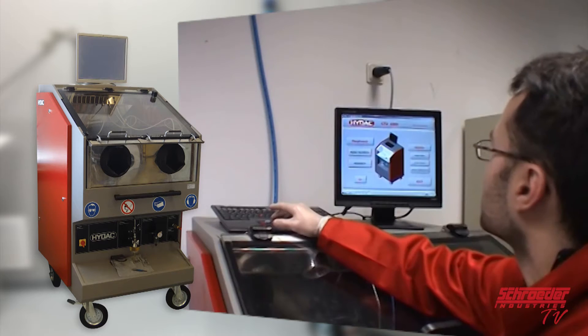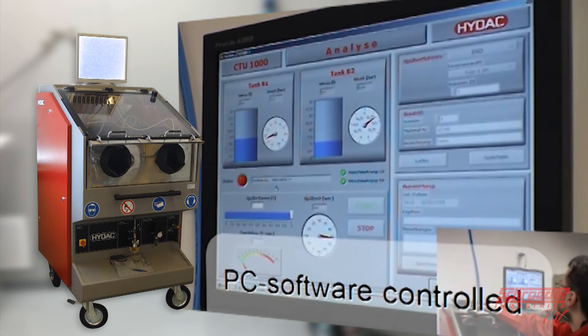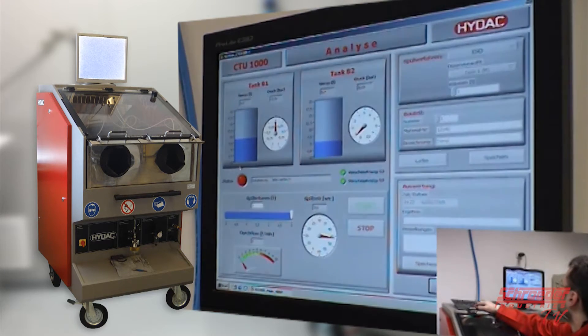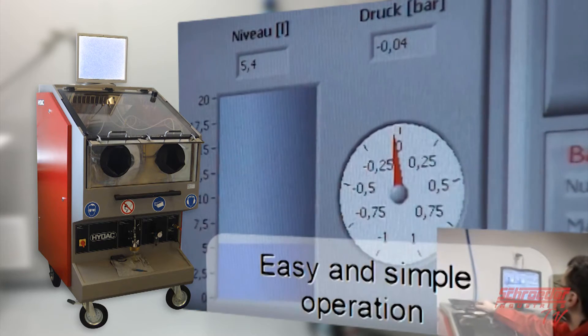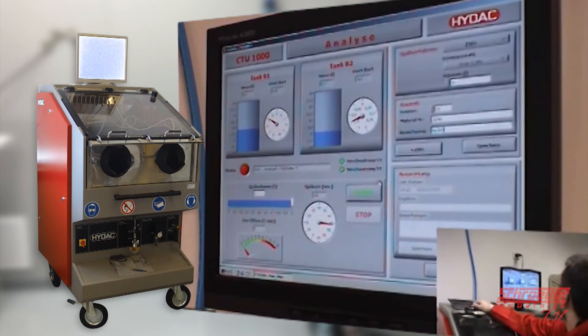For easy use, the CTU offers a manual mode where the operator is able to manually control the pressure, time, and length of the rinsing process. This process can also be programmed in an automatic mode. As an added feature, the CTU allows the user to add pictures and instructions on how to rinse a particular part, ensuring that different operators handle parts the same way so results are consistent and repeatable. Similar parts can be set up by copying an existing file and updating it as necessary. Make sure to save as and not overwrite valuable data.